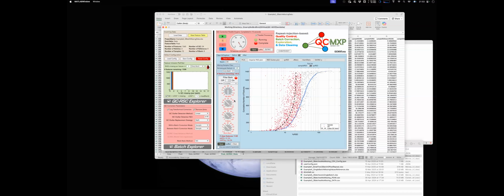Okay. So comparing version 1.0 to 2.0, I note that the option for the effects like additive or multiplicative, I think, is removed from version 1 to version 2. Can you talk about that? Well, I primarily did that because you asked me to, Raphael.